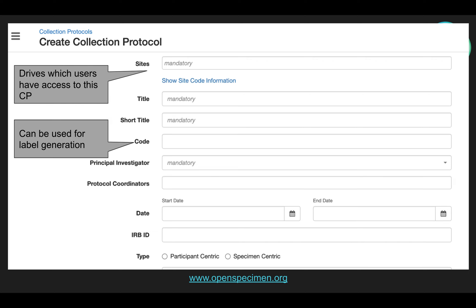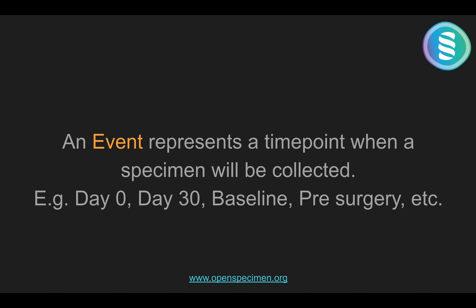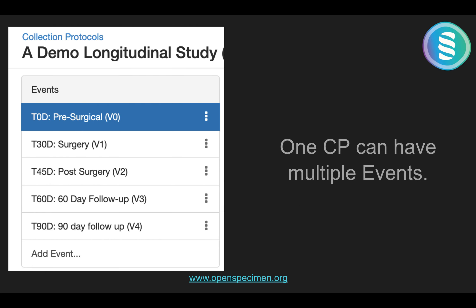Once you create a participant-centric collection protocol, you will next need to configure the events. An event represents a time point when a specific specimen will be collected — for example, at day 0, day 38, baseline, etc. A CP may have multiple events.